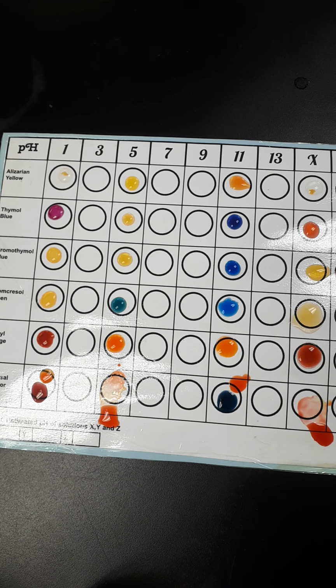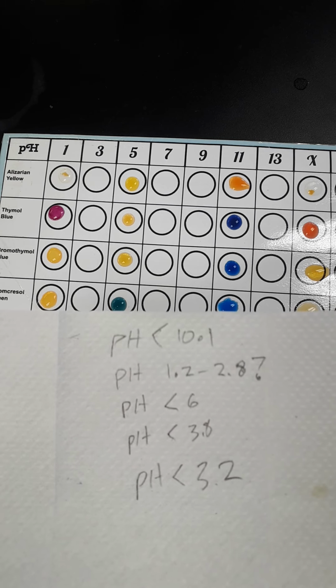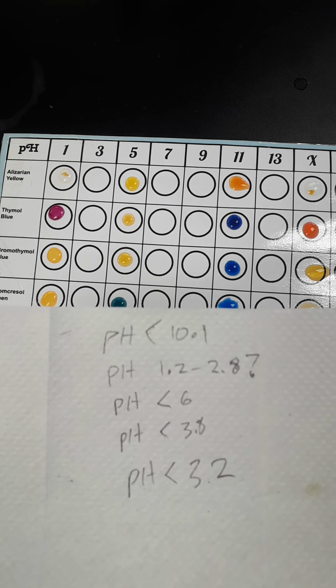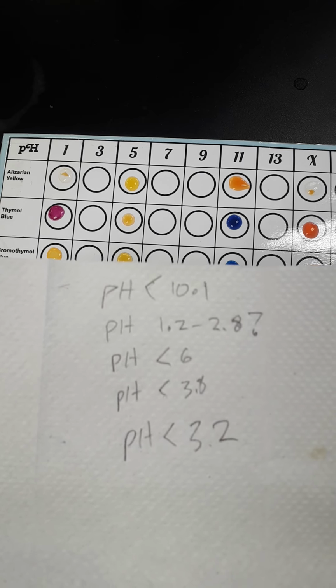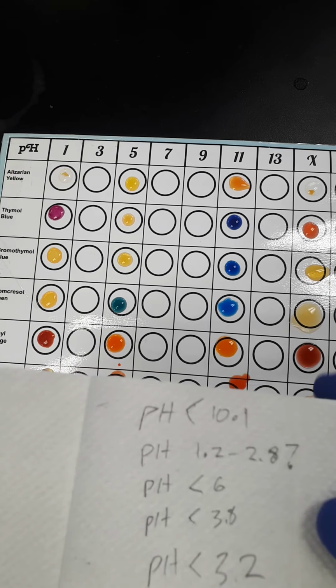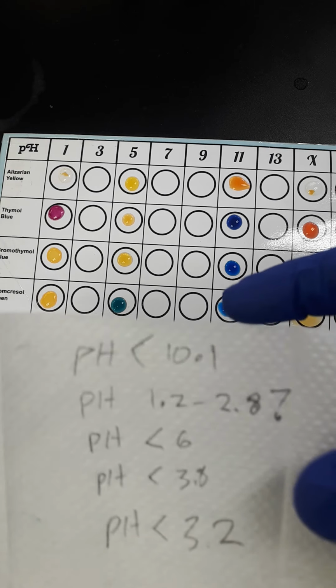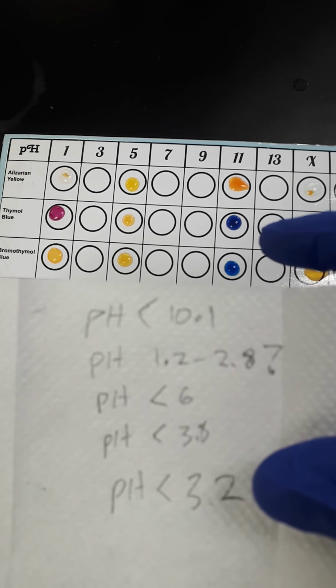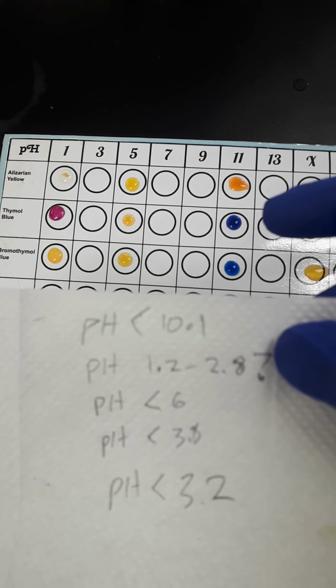So when I look at my pH range for this, I think I should have chosen a better one. It is less than 10.1. It's also less than 6. It's also less than 3.8. It's also less than 3.2. So that means it falls into the one that I was a little unsure about. And you might do a little bit better with this. It's either less than 3.2 or, depending on my level of color blindness here, somewhere between 1.2 and 2.8.